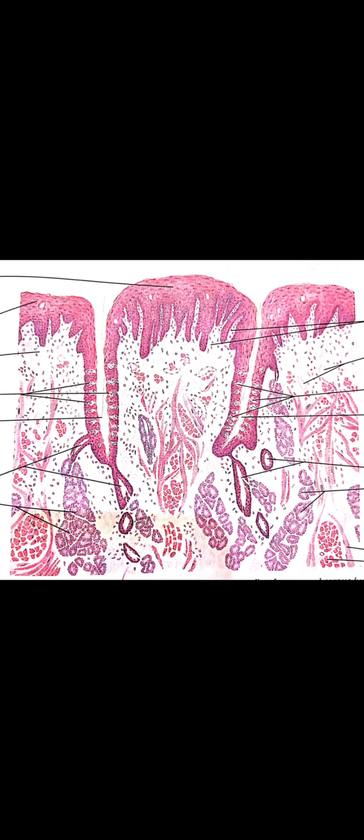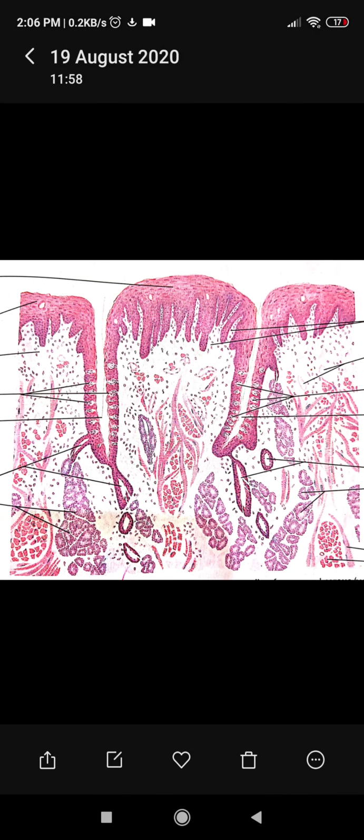The secretion of these glands provides a continuous flow of fluid over the taste buds that are abundant on the sides of these papillae, washing away food particles so that the taste buds can receive and process new gustatory stimuli. So these are the circumvallate papillae, and associated with them are the von Ebner's serous glands, which secrete fluid into the trench-like space around the circumvallate papillae.